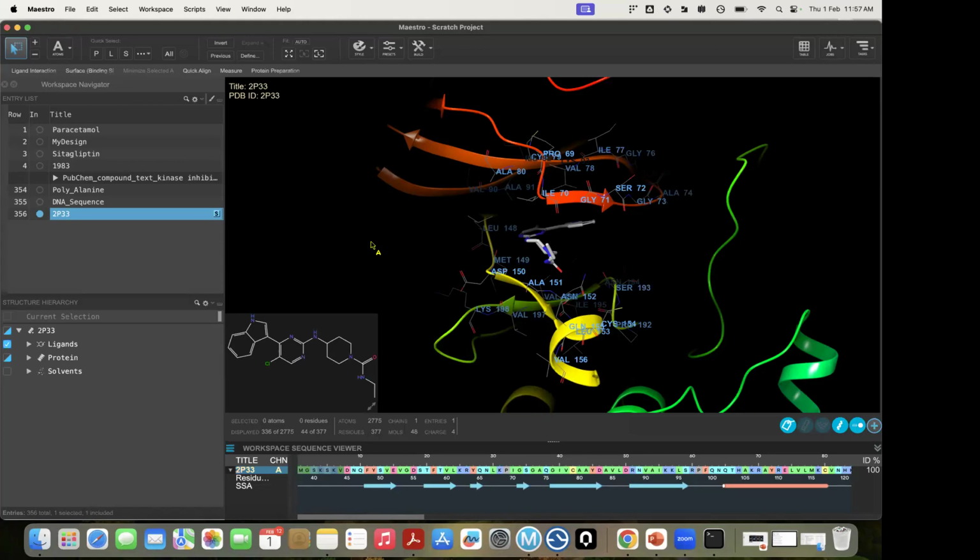Suppose there is lead, a toxic element. There is EDTA, which is a lead complexing agent. I want to see EDTA in complexation with lead, how potent that binding capacity is and what the score is. In the same way, I want to compare the phytochemicals in the same pattern as EDTA, how they bind with lead, and which functional groups are responsible for attaching to lead. When compared to EDTA, what are the scores of the phytochemicals? How far do they bind with lead? So I don't think docking will help you. You need to go for molecular dynamics. Okay.